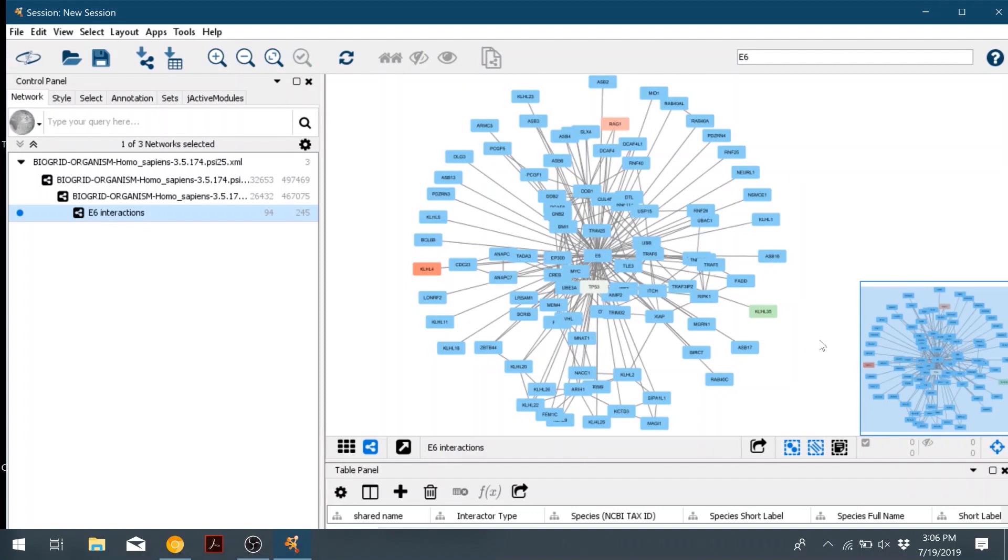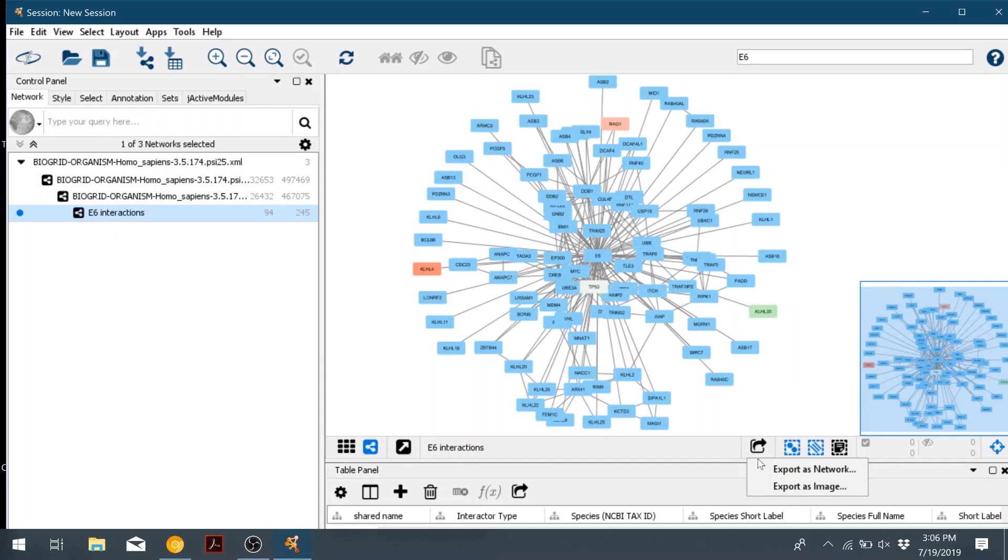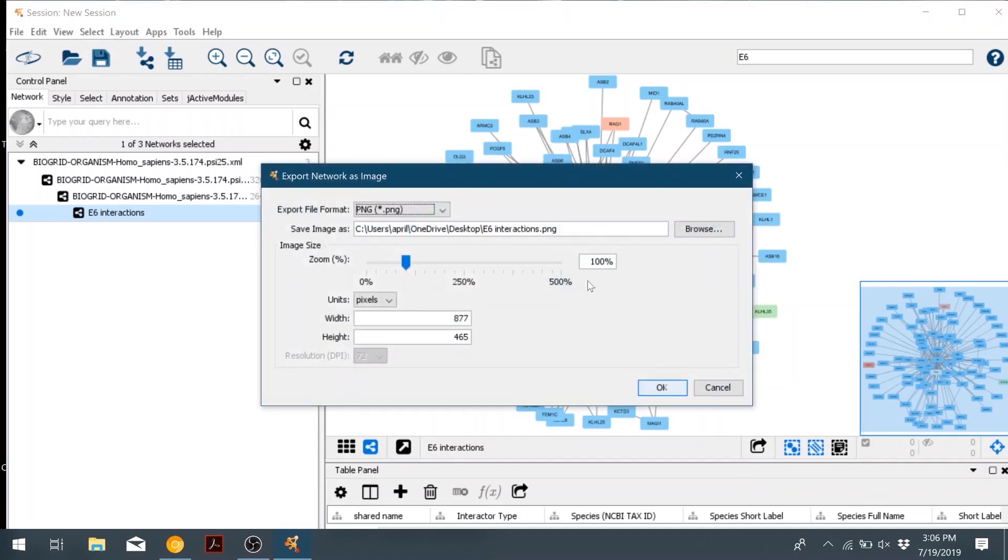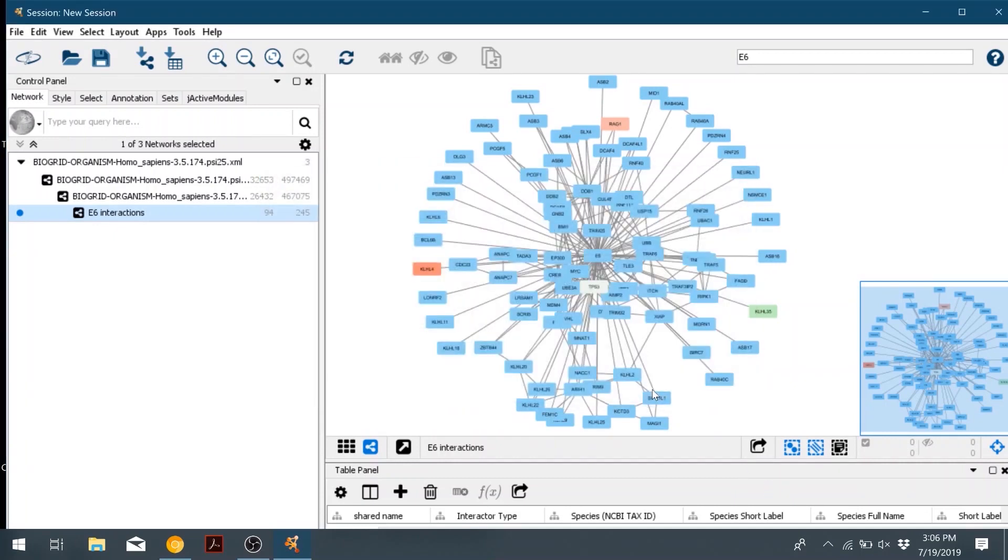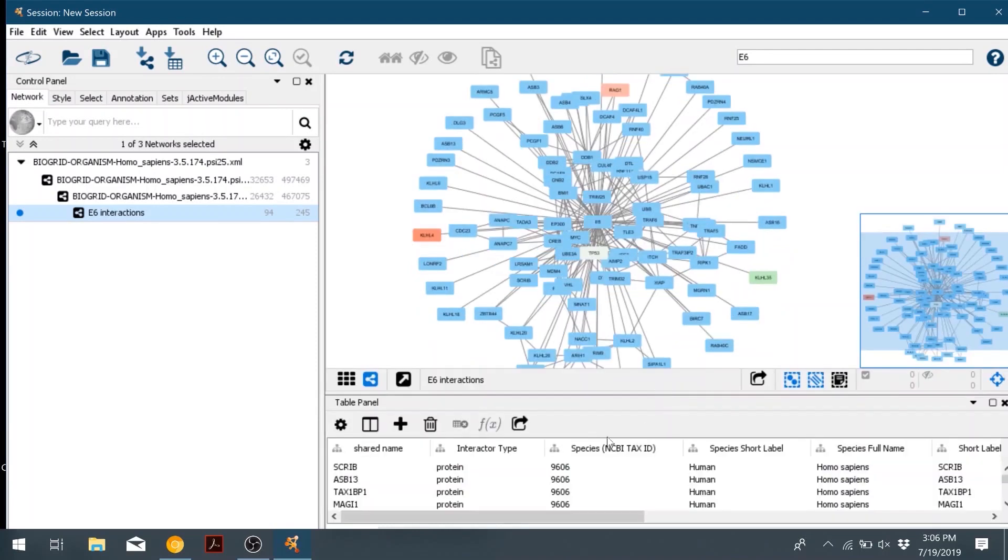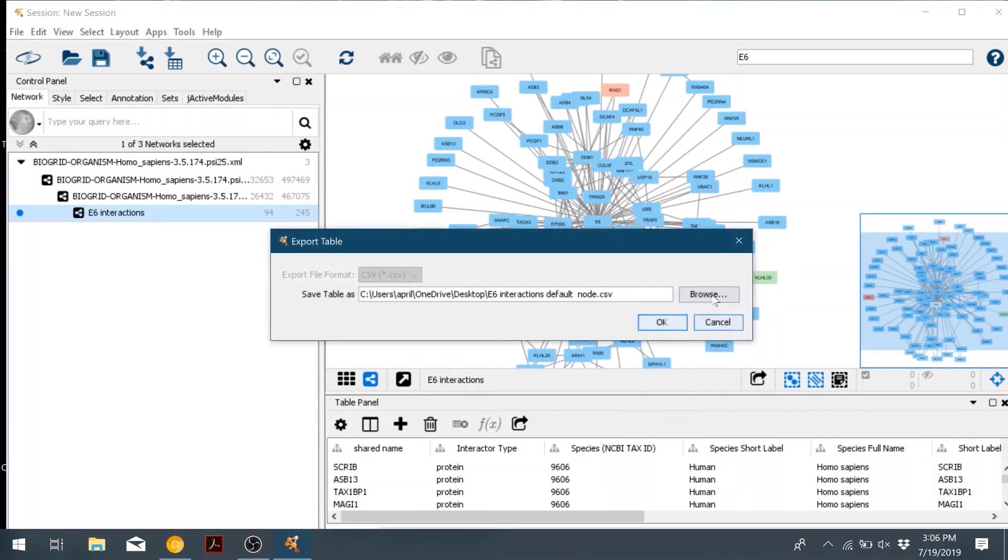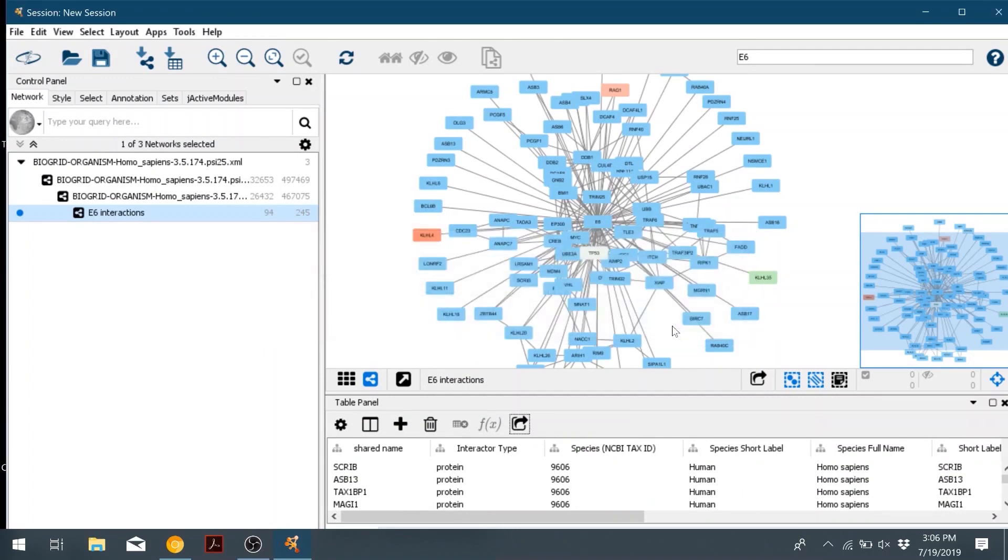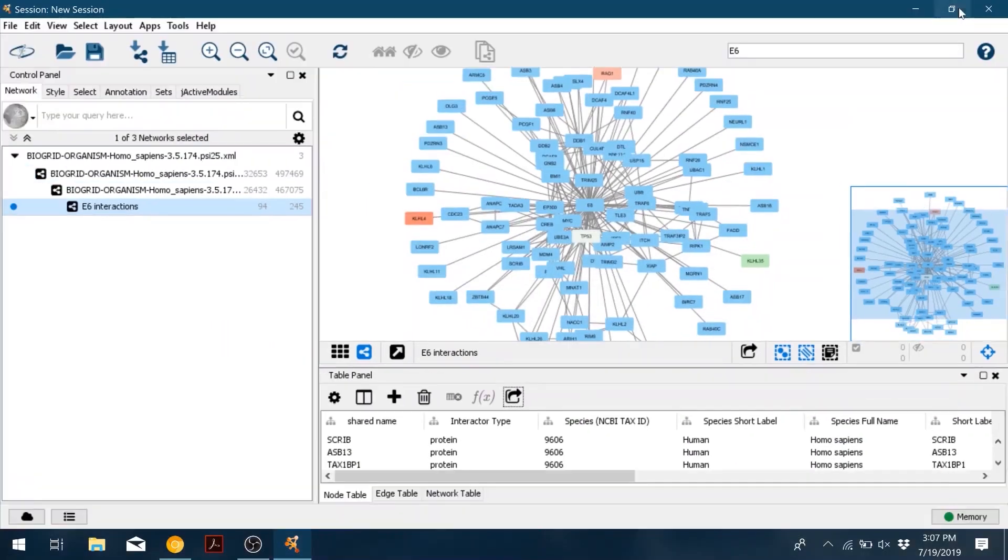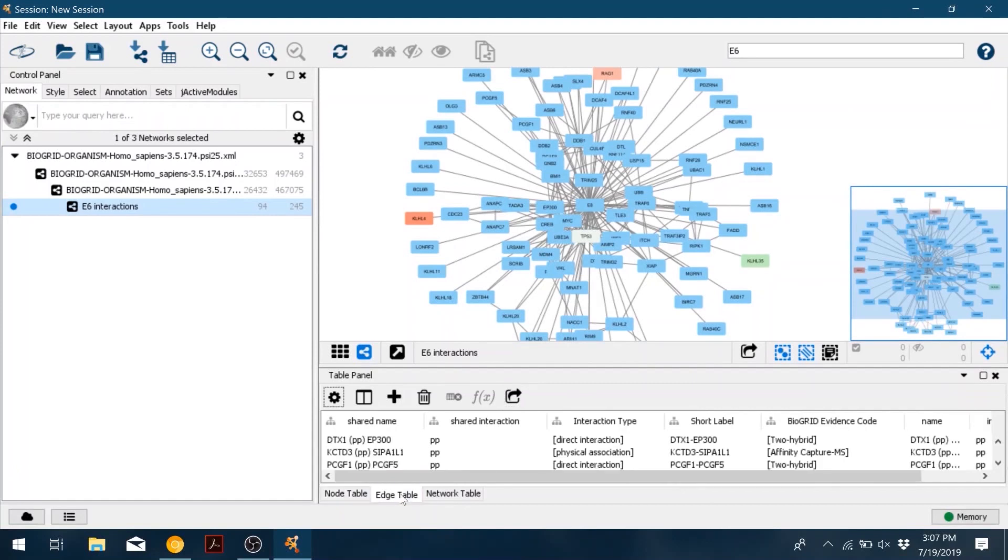And if you wanted to save this network as an image, click the little side arrow down at the bottom and click export as image. And then you can save it. And additionally, if you'd like to save the node table, you can click that similar arrow down below and save that. It will save as a CSV. And you can also save the edge table.